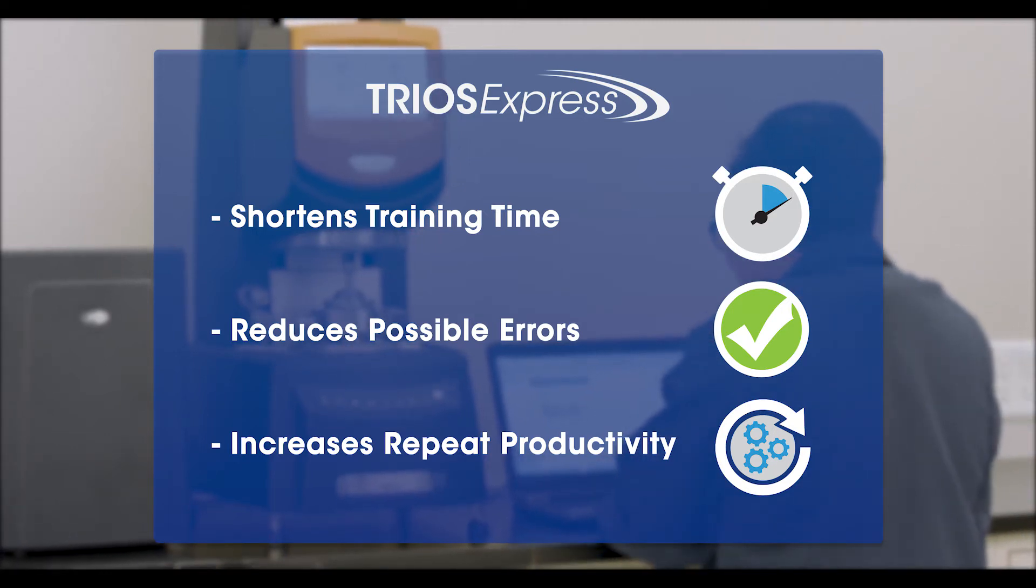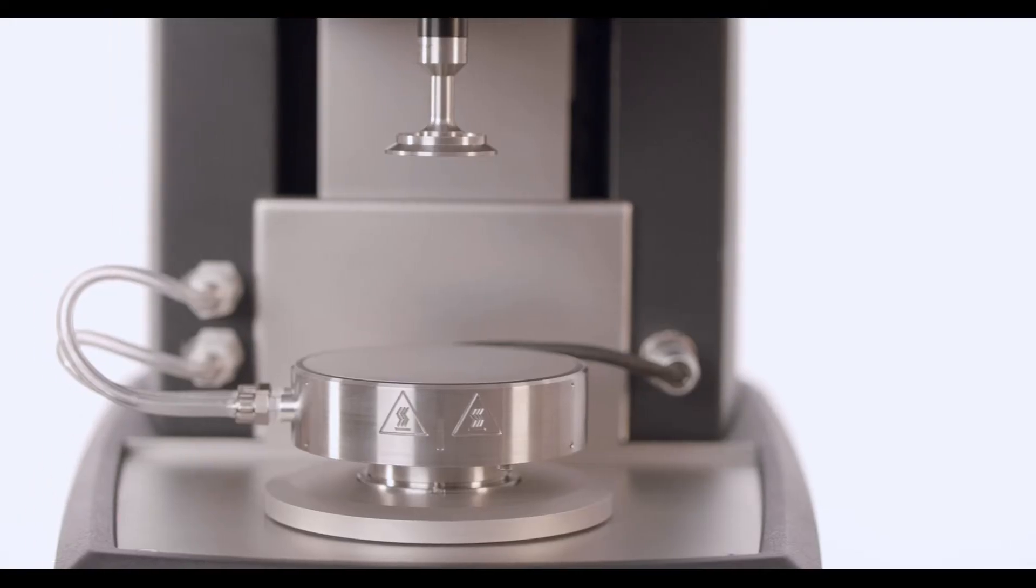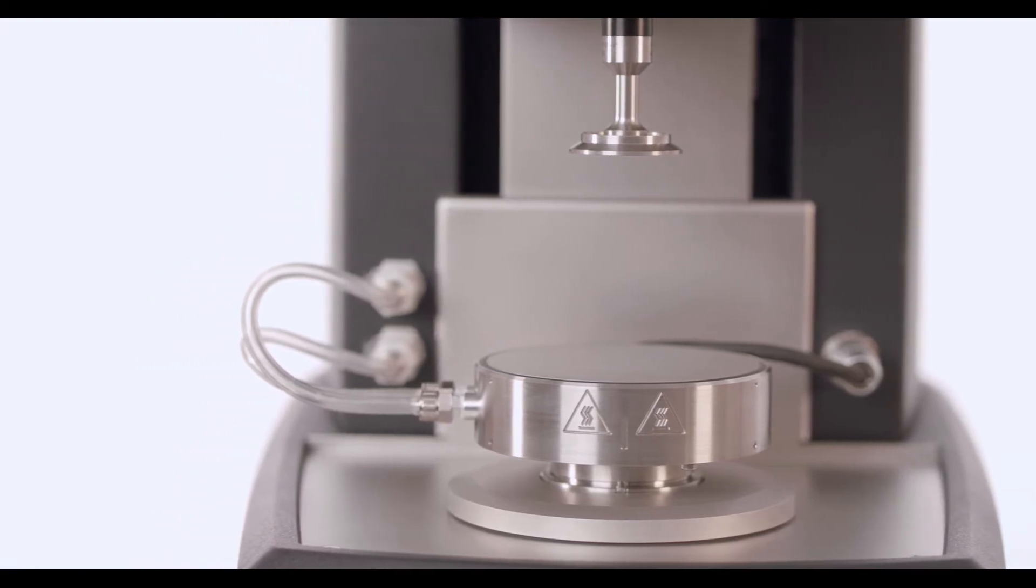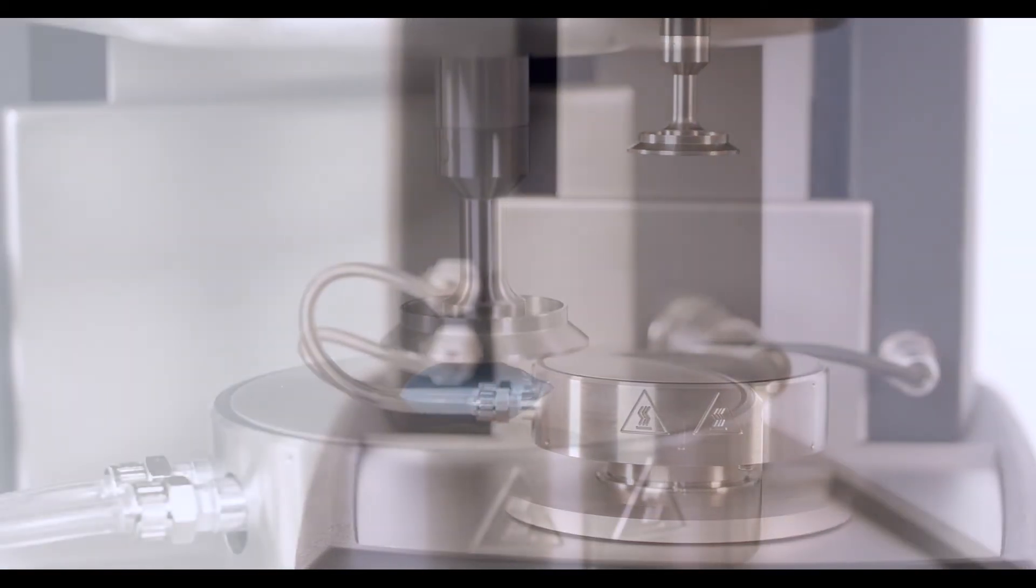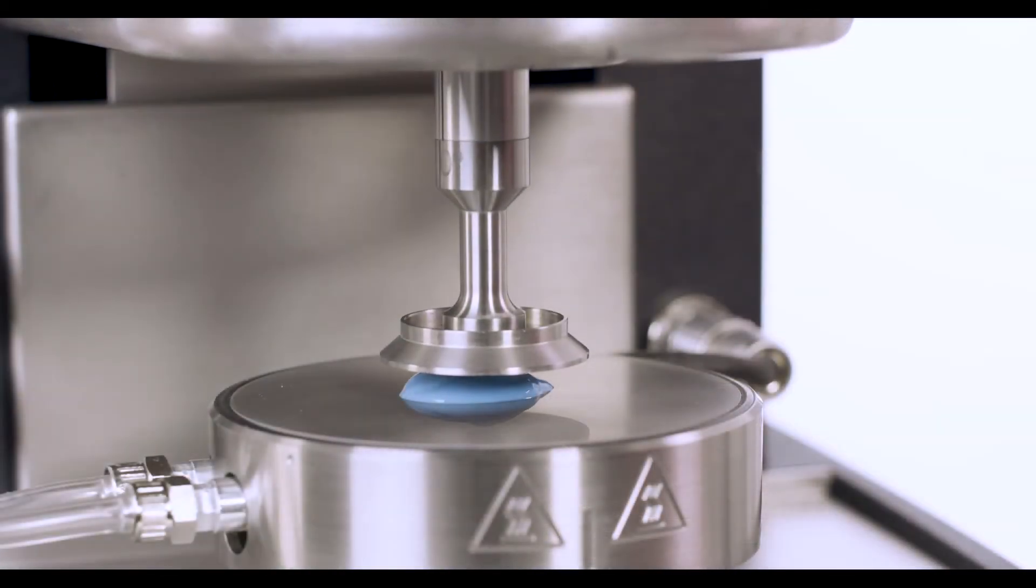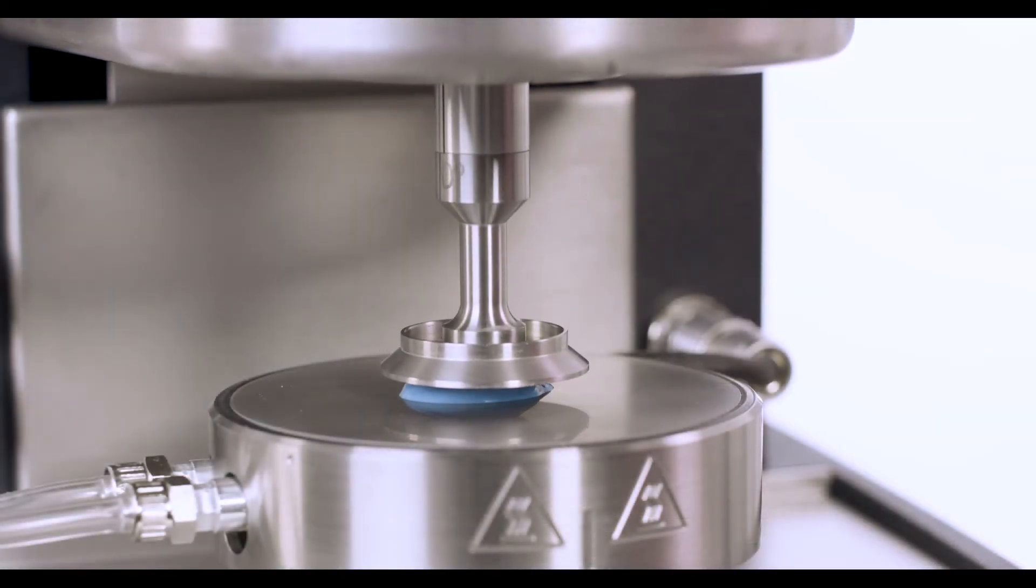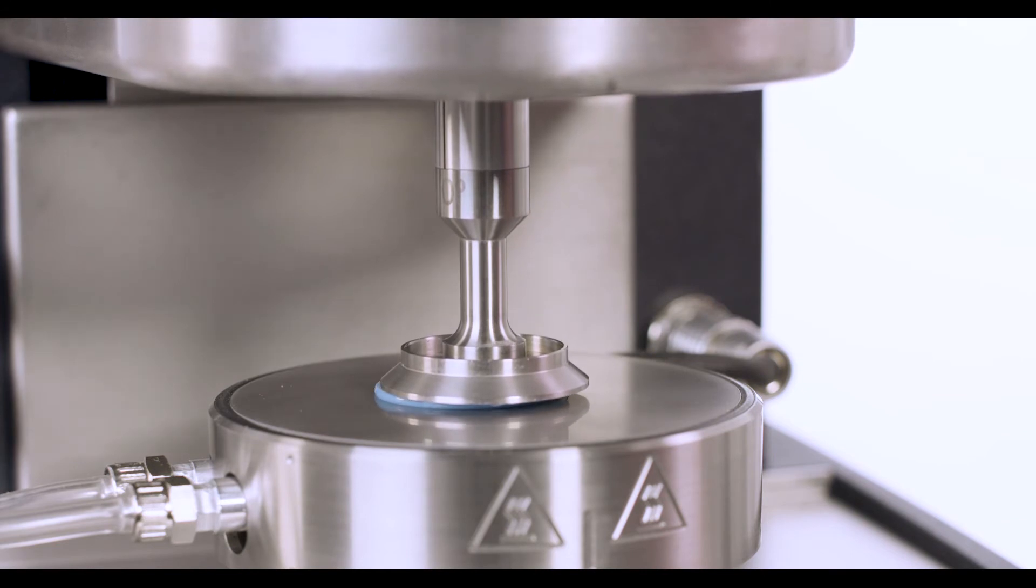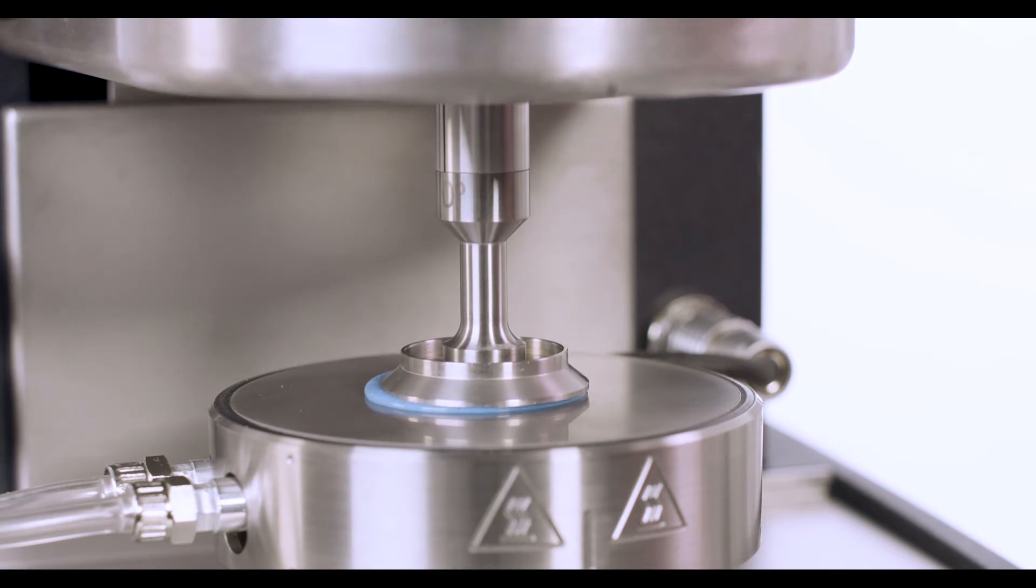Here we will demonstrate how to use TRIO's Express mode to set up two simple, well-defined experiments to measure the viscoelasticity and viscosity of a lotion sample.